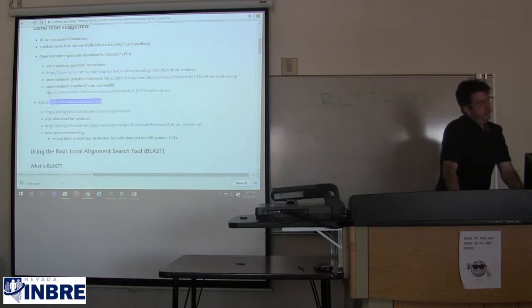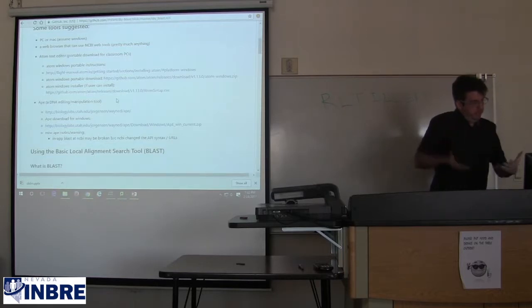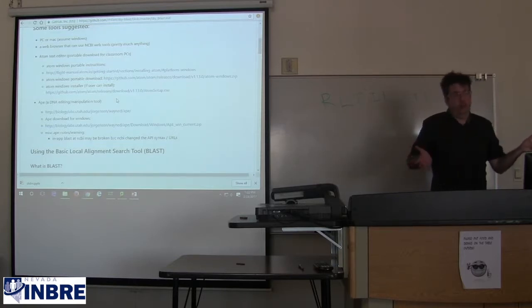The idea here is that if you were enrolled in Laura's Special Topics course, you may have encountered sequence information in a context of a kind of more all-in-one package as part of the CPhages course. You may have encountered sequence information with tools that seem very specific to CPhages that have documentation like this. Related to that project, whereas with these tools we don't have to be anchored to any of that sort of stuff.